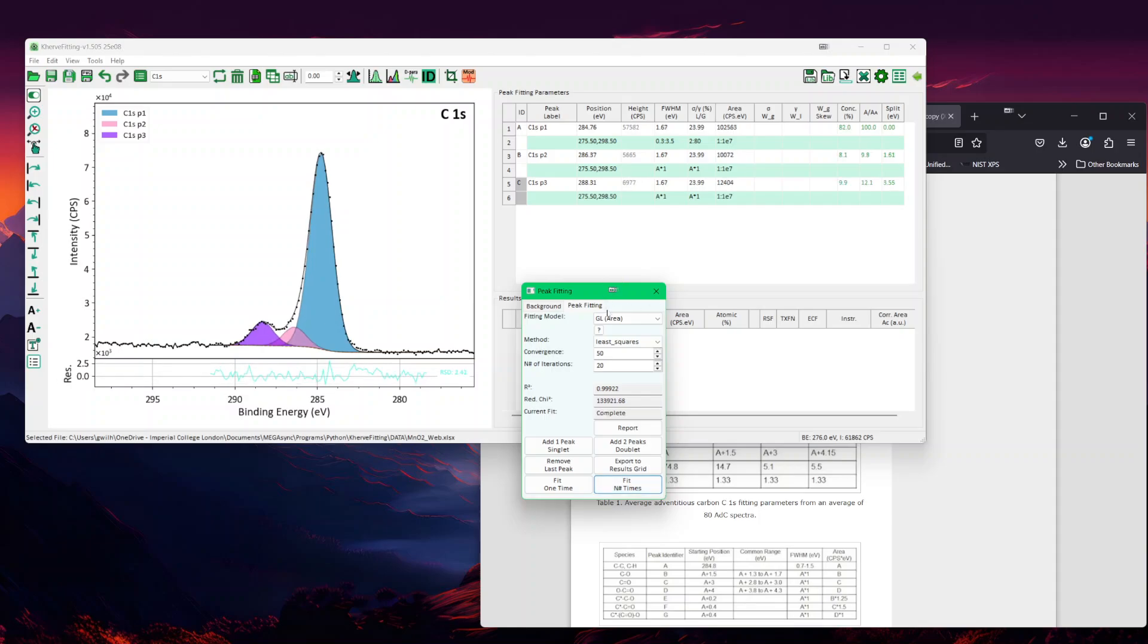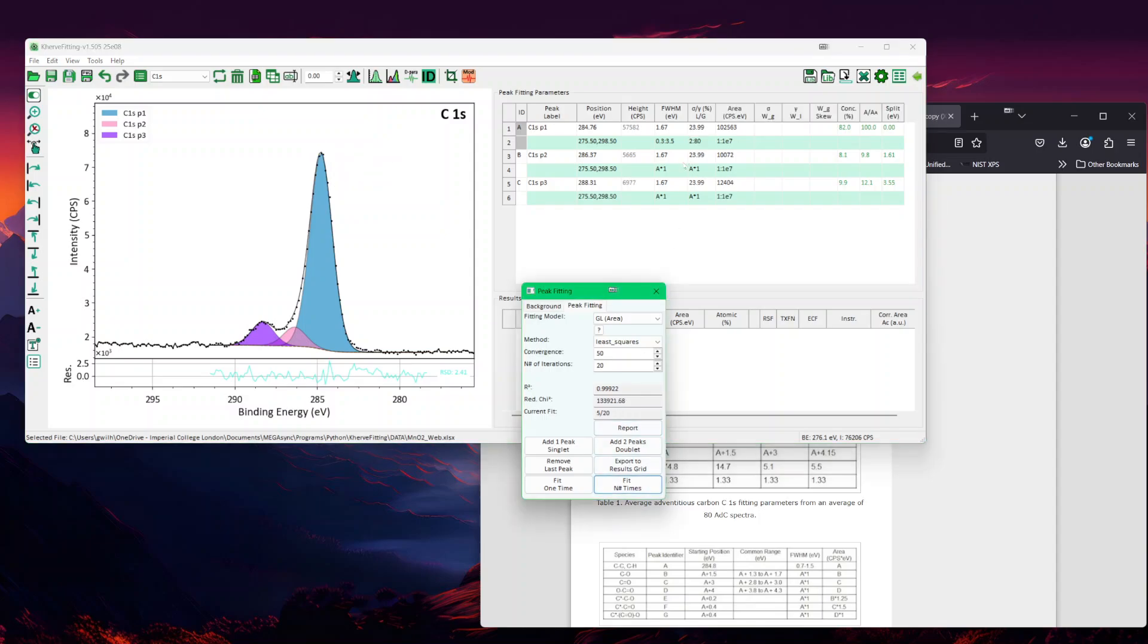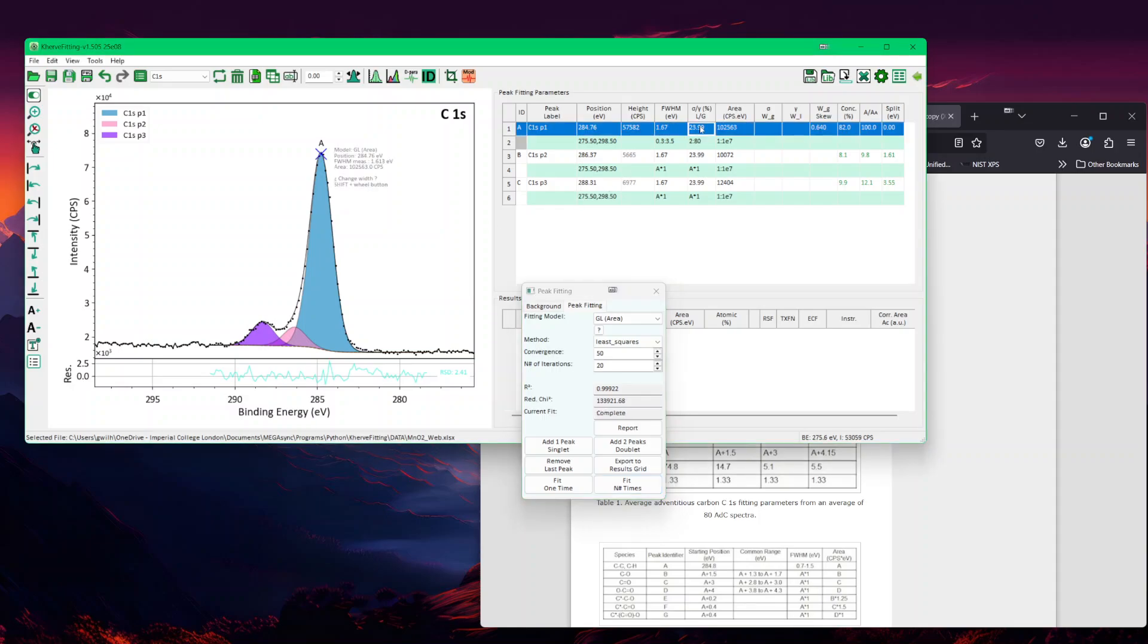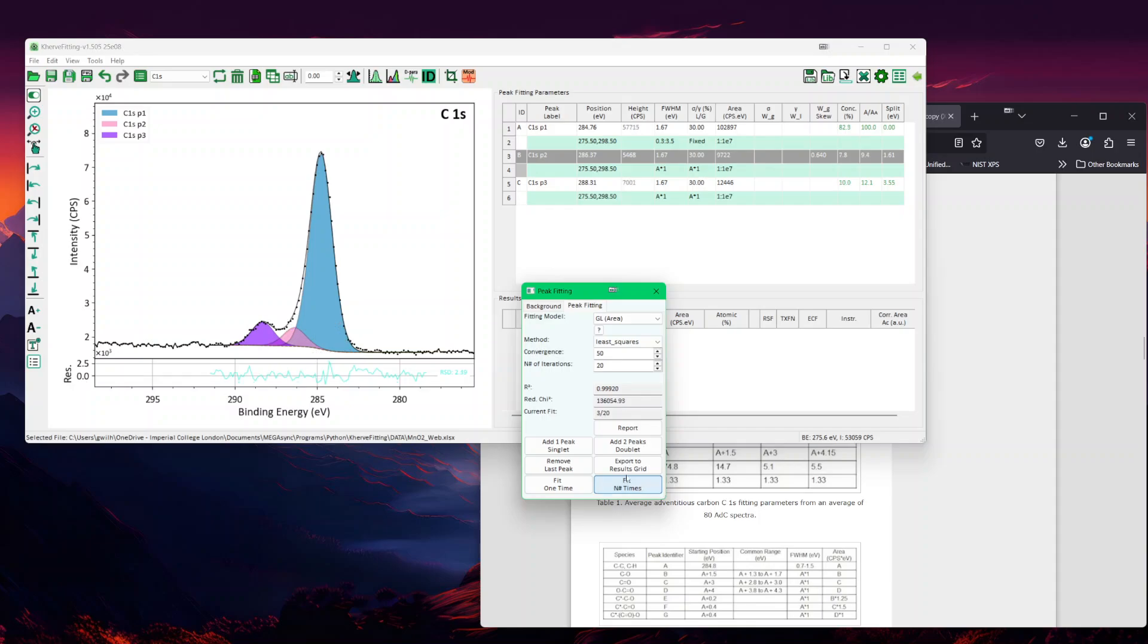I must mention, I have realized that this was a GL. This should not be 20%, but should be around 30%. If I now fit this, he wanted, as you can see, if I go to fit N times, he found that the best model was done with 24. I can actually fix this by putting 30 and write FI, like fixed, and that will fix the model at 30%. Then now there is hardly any difference between the two. This is the best default.